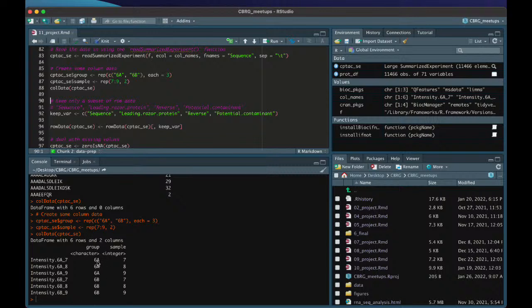And so the statistical analysis we'll be doing will be comparing this one group of A's. So these 3, you can think of them as biological replicates. We'll be comparing these 3 A's with these 3 B's. And that's it. So it's a simple comparison of 2 groups.